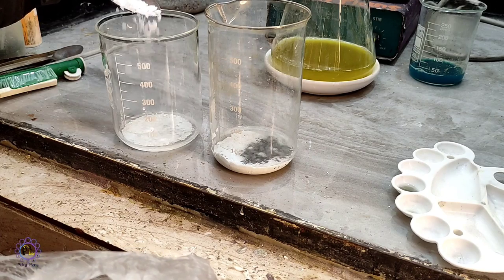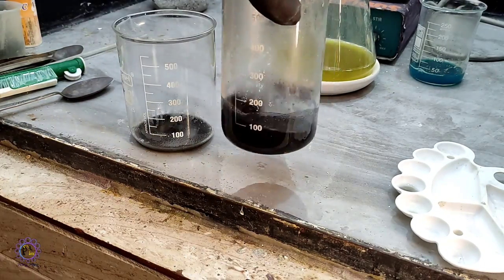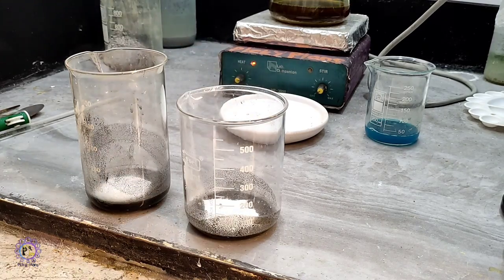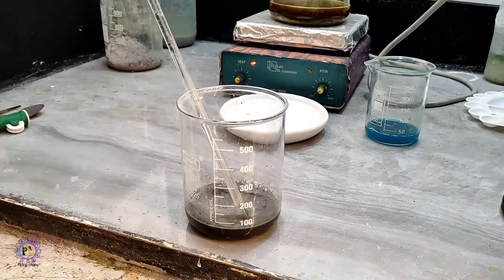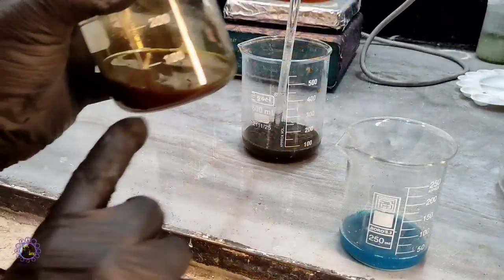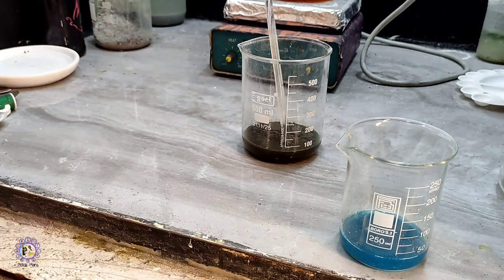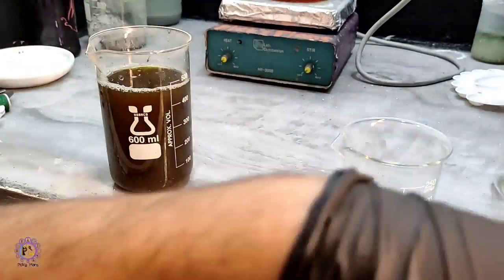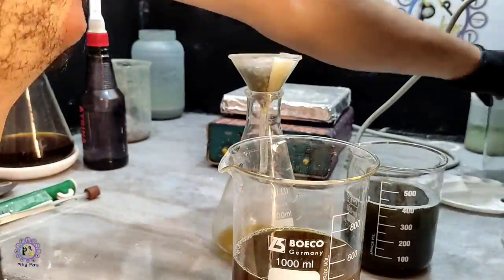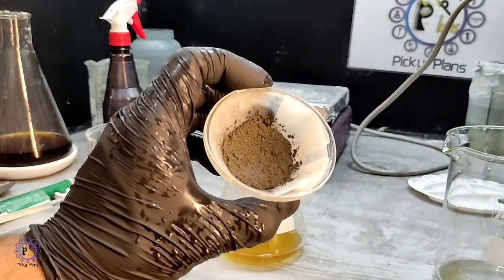And to this one, I add some glucose powder. And we have silver reduced here. So we just need to wash this solution with water. This is the silver content from the magnetic materials.